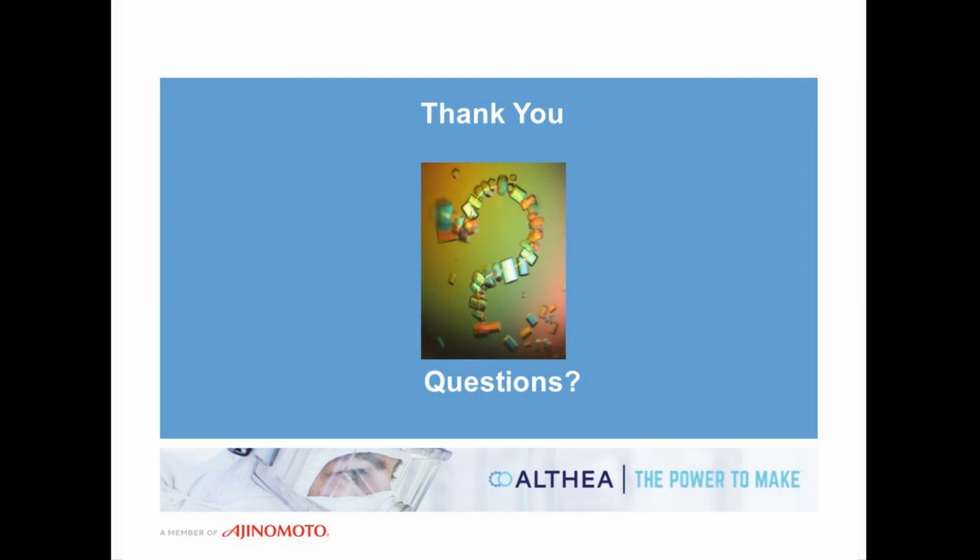Yeah, so just to mention that here in the lab, we haven't worked with anything really heavily glycosylated, so I can't give a personal example that we've worked on. But literature does show that it can also be a little difficult to crystallize these heavily glycosylated proteins, especially when we're looking at crystal structures, because you really need to make sure that you're looking at homogeneous protein samples. So the glycosylation can cause some issues with that. A quick literature search did show some examples of some crystallized glycosylated proteins, and I can share that.